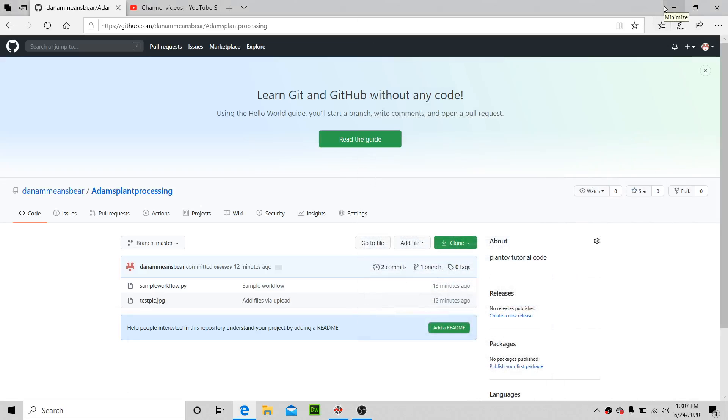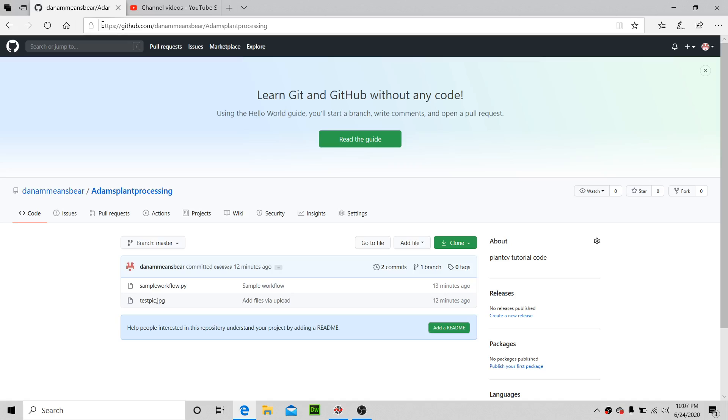All right guys, welcome to part three of this video series. Right now it's time to get some code working. Okay, so first what you're gonna do is go to my GitHub right here.